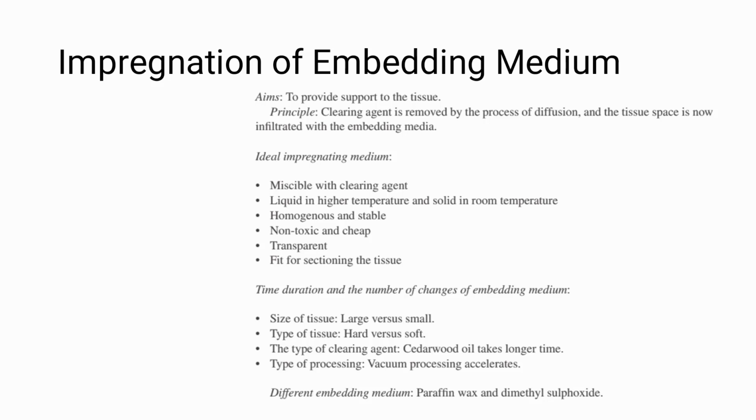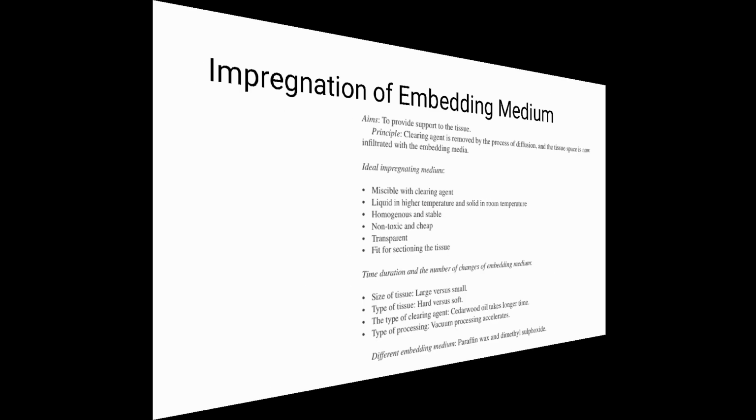This is the whole scenario of impregnating and embedding medium: the aims, the ideal medium, the duration and the difference in the embedding medium. Usually paraffin wax is used. Another embedding medium is dimethyl sulfoxide. It is also used.